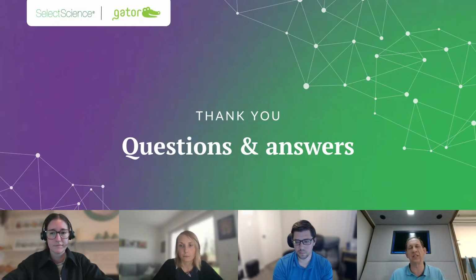When the run finishes, all the data is taken from the computers that are all connected to the network into our system. We do the fitting, and usually there is, at the moment, still a human review of the data to be sure that there was no problem.